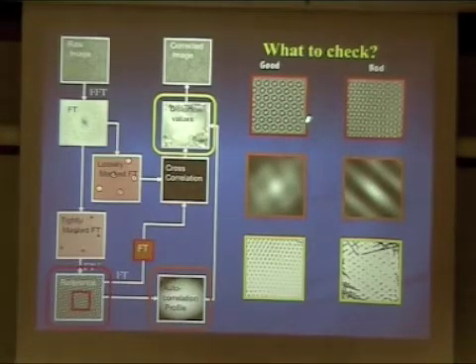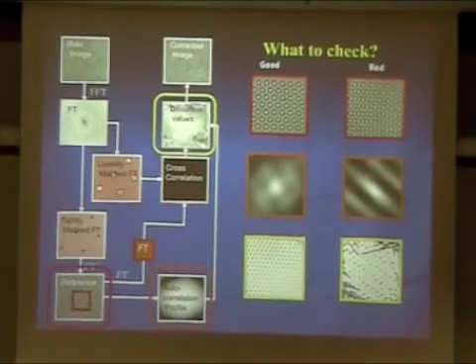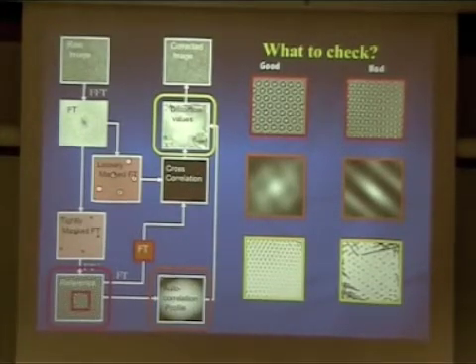It's already several unit cells in there. The distortion we are getting is, in a way, a smoothed-out version. So whatever you are seeing should be smoothly transformed in one direction or the other. It shouldn't be zigzag like that. Okay?